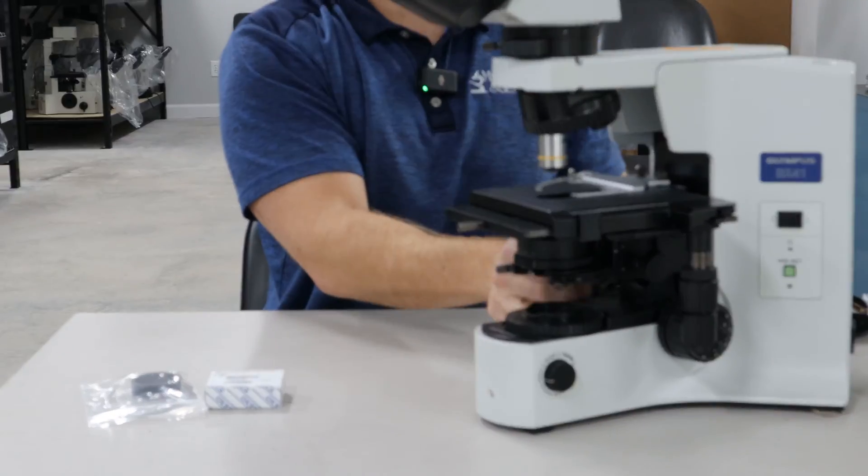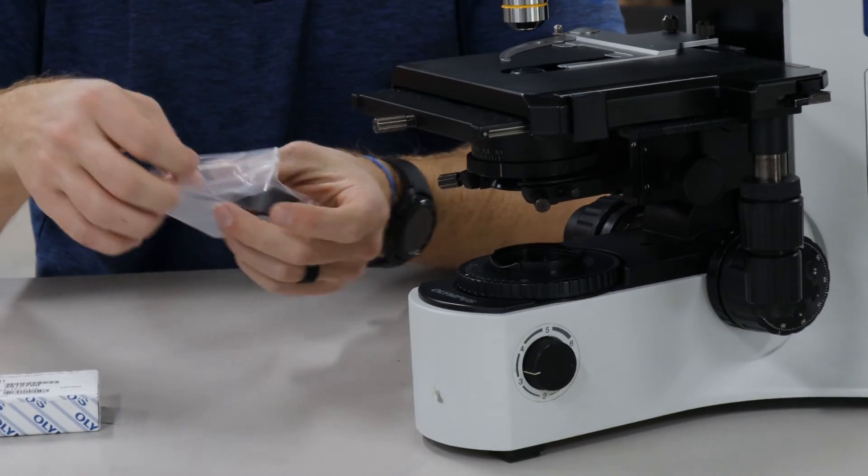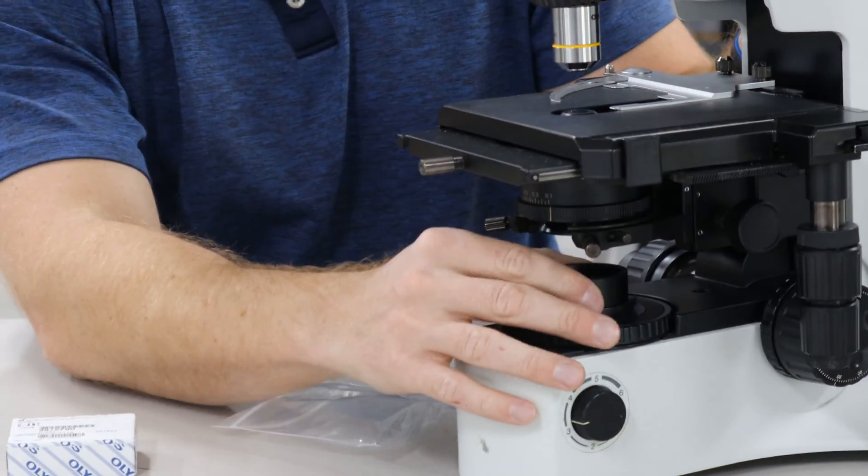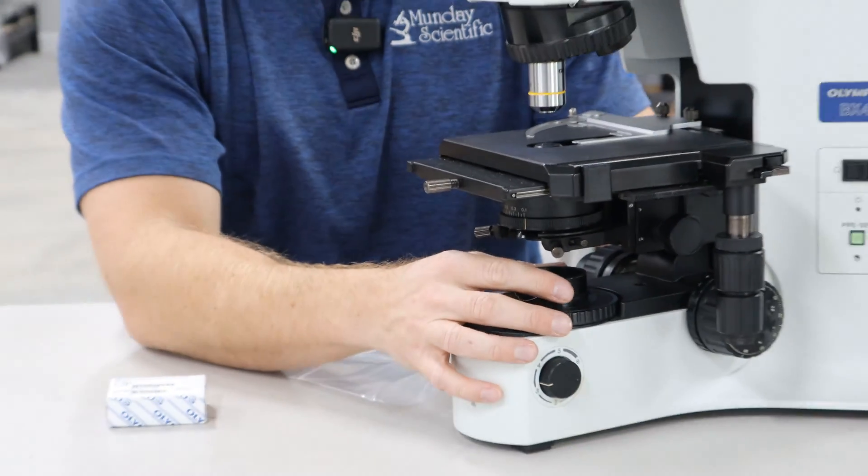Once you put your analyzer in, the polarizer right here very simply just goes over the light source, and then you can rotate it across the poles.